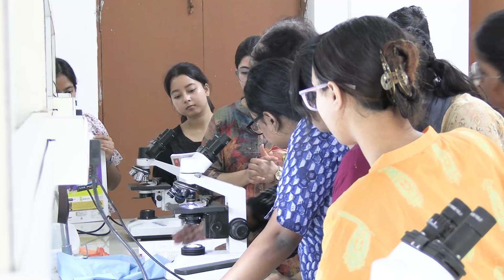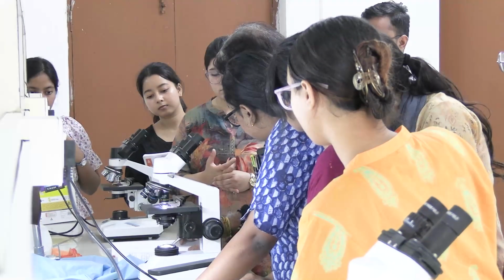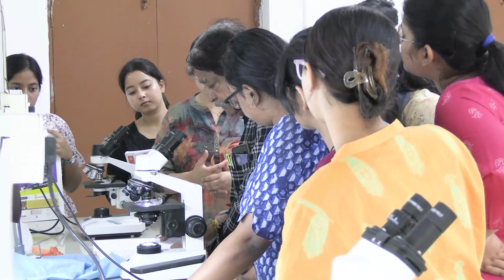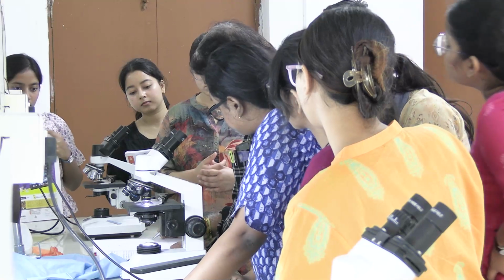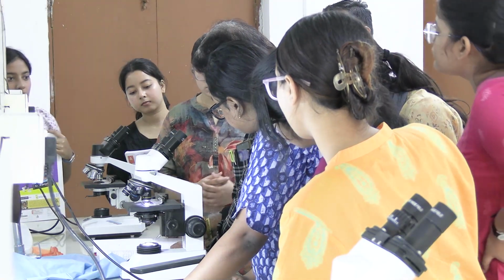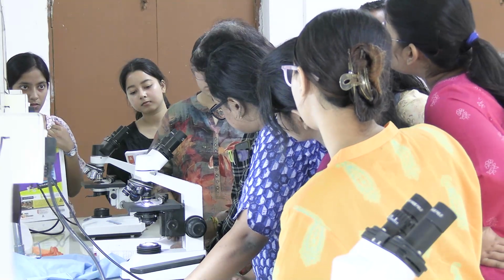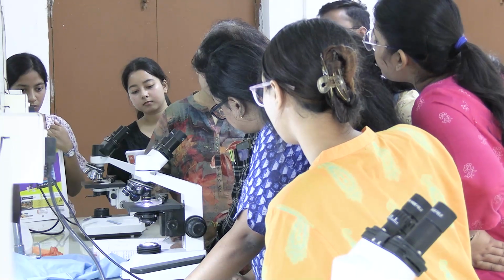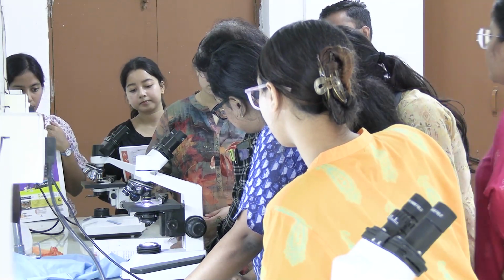As you see, you compare and label. Now this is the lymphatic nodule. This is the germinal center. This is the medullary sinus.